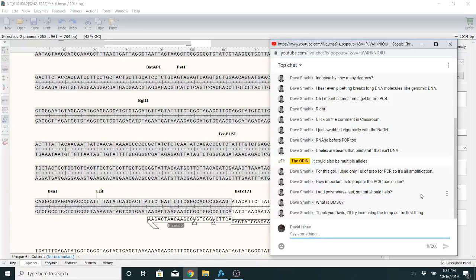with that one. And sometimes you just have to start with the standard protocol and wiggle around a bit until you sort of bump into something that seems to be working, and then go more that direction. Increasing the temp is the first thing. That's what I would do. What temperature did you run it at? I assume the one in the protocol.